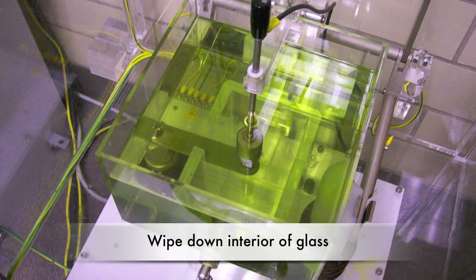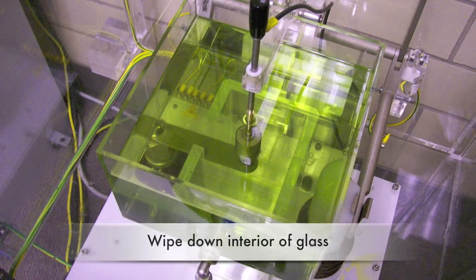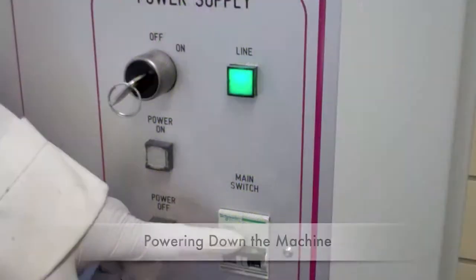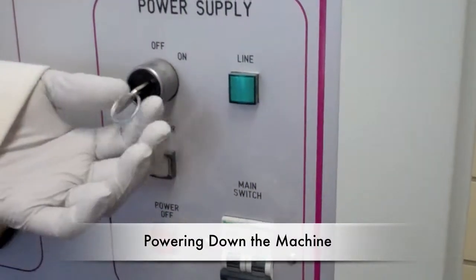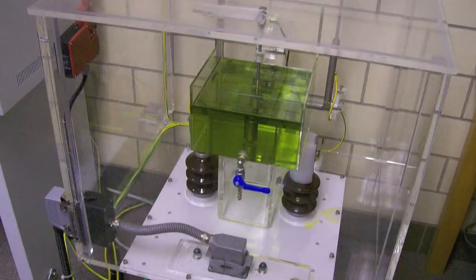After your runs are completed, wipe down the interior of the oil bath housing where oil may have dripped. Turn off the main switch and turn the key to the off position before you remove it.